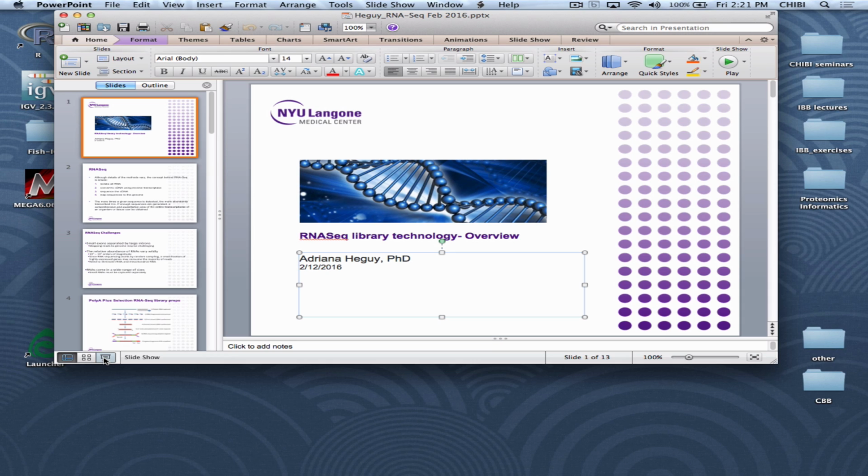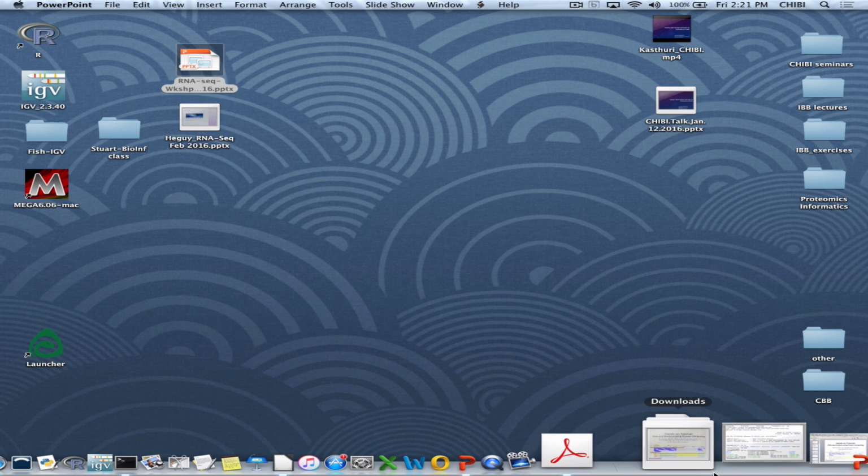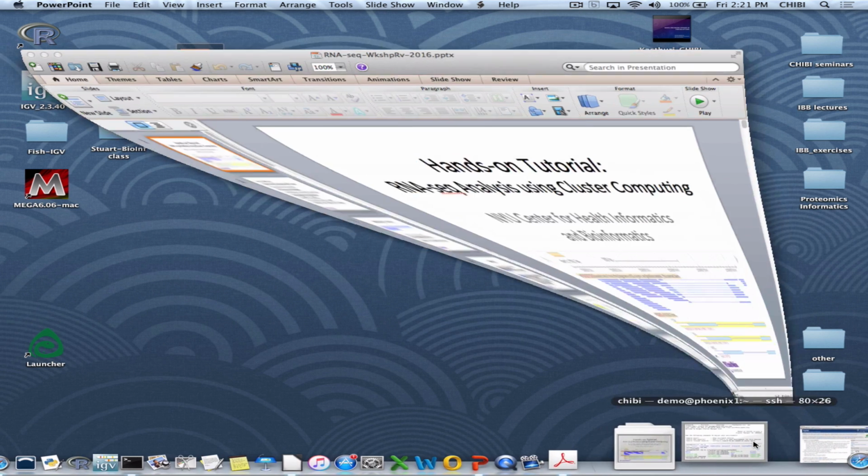Any questions? All right. Thanks. I have a question. Yes. Regarding bacterial RNA, you give them poly-A tails. You mean artificially? If you want to add poly-A tails artificially to your bacterial RNA?